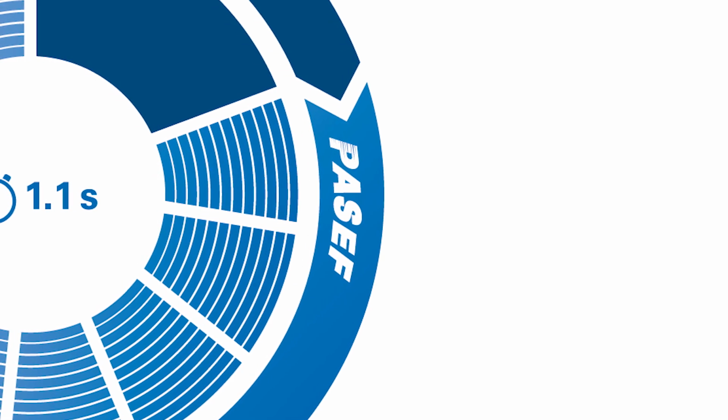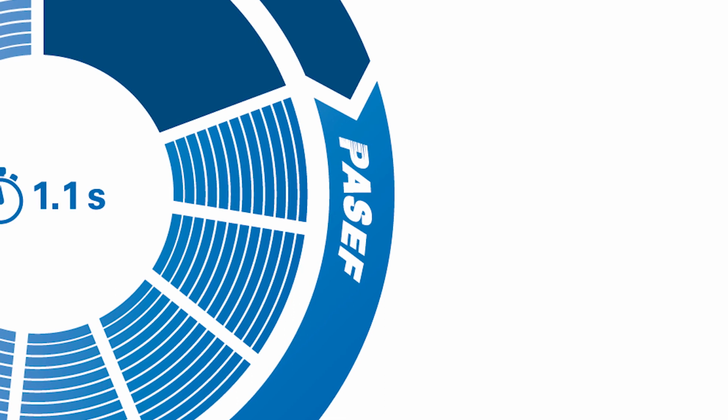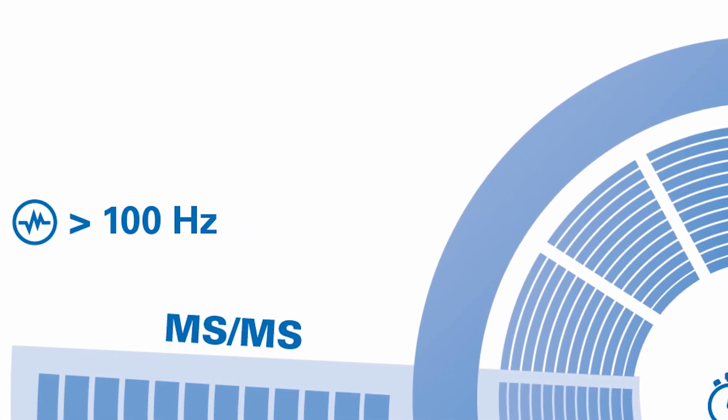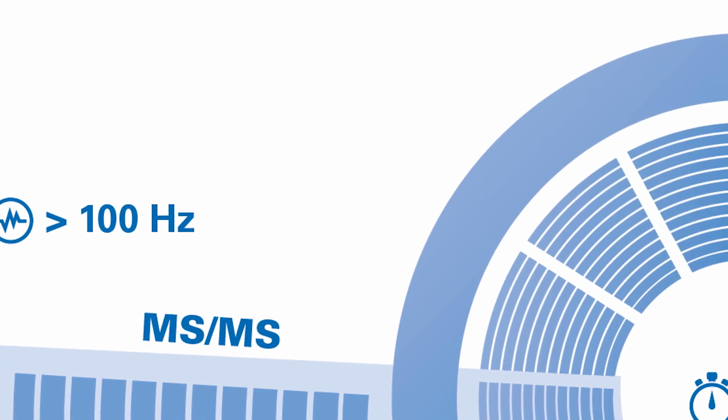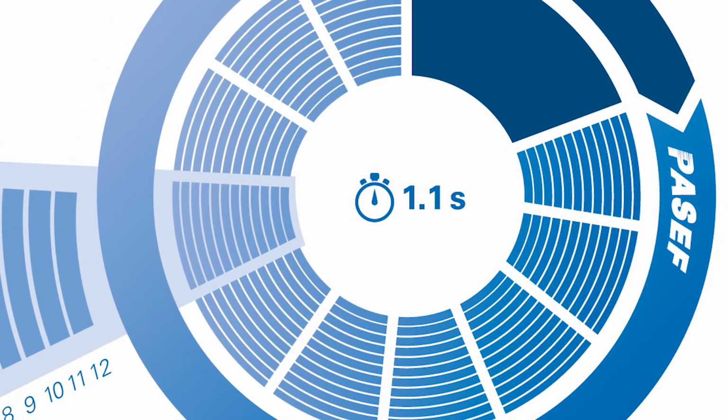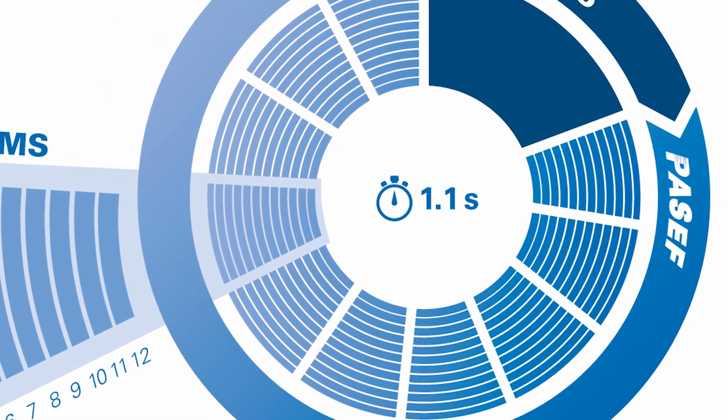PASEF is a method that really exploits this trapped ion mobility on top of what we can already do with the current architecture. And it's a very neat trick in running the sample so that we can get up to 10-fold increase in sequencing speed.